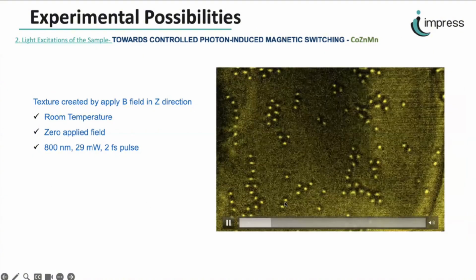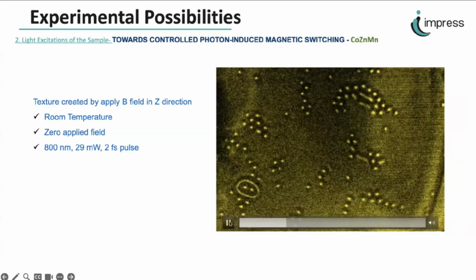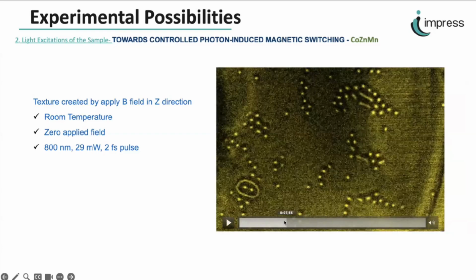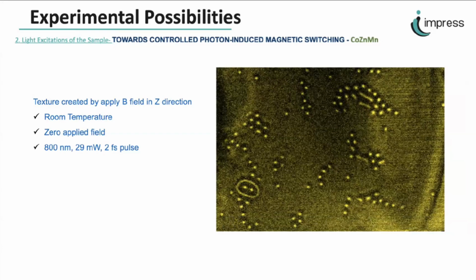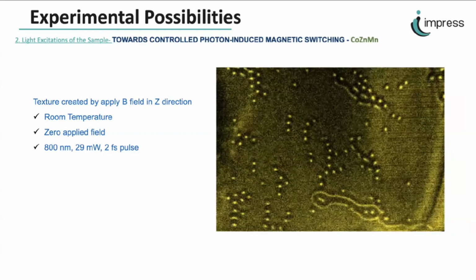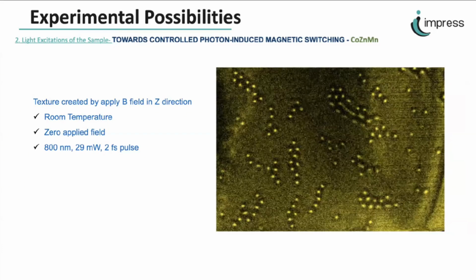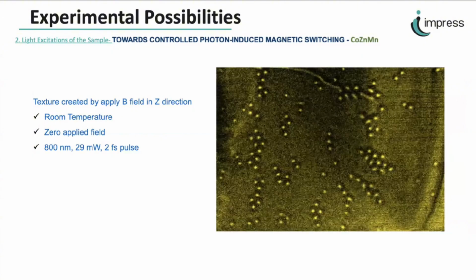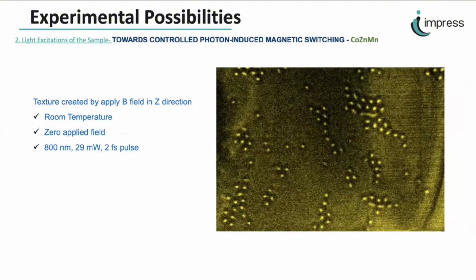You can see much higher activity in the skyrmions, and in some individual snapshots like this, you can see we can create skyrmion bags or different exotic magnetic textures, which are not common in conventional studies. So this is another possibility for this kind of study, where you can create novel magnetic textures by a laser pulse.